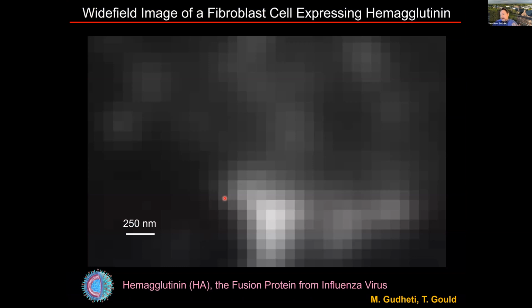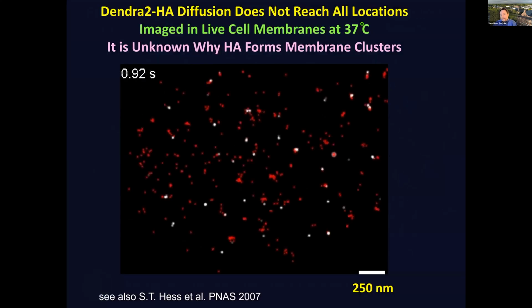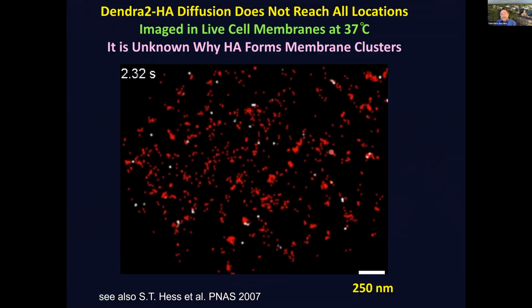So what can we learn about influenza using these better views? Right, the clusters here, which we said we thought were important, are much better visualized. The shapes are clearly not entirely rounded, which was one model. That's not the case. They're highly irregular. And why are they so irregular in shape?